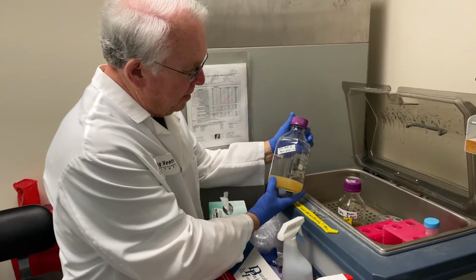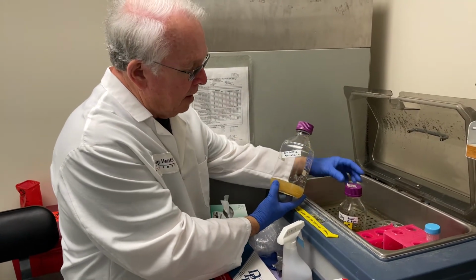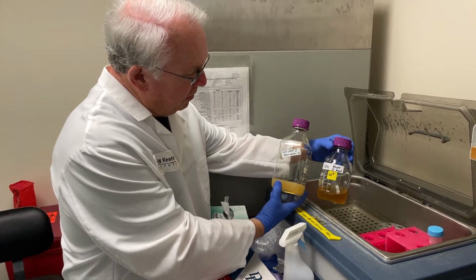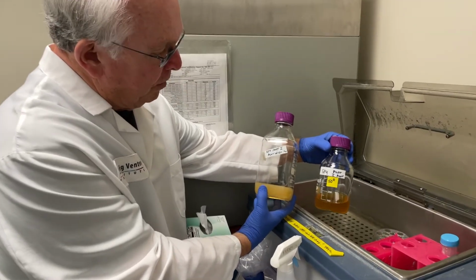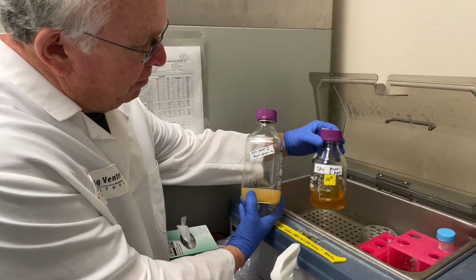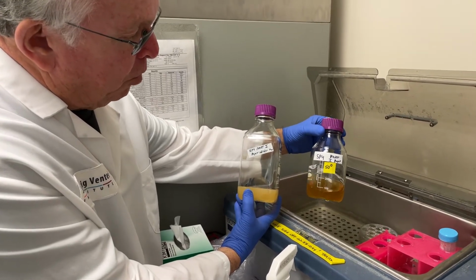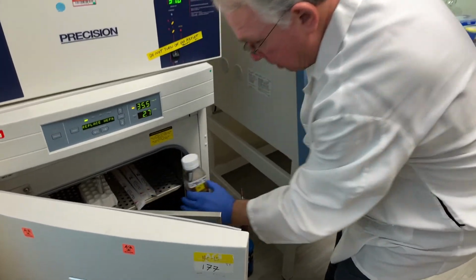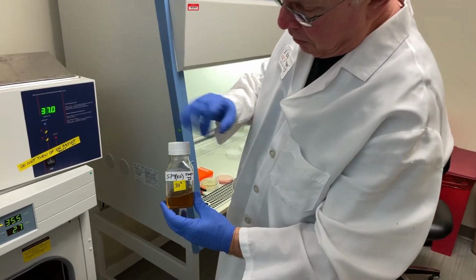The video starts showing the solid agar medium in part one, which can be microwaved to boiling multiple times to get it completely dissolved. And then that part one solution can be equilibrated to 50 degrees and maintained prior to this procedure.